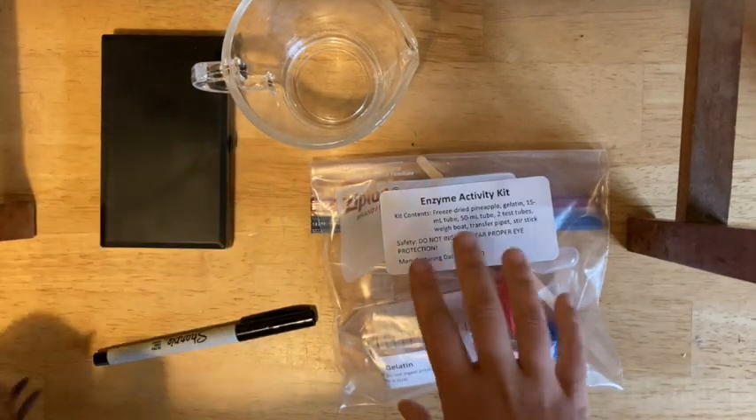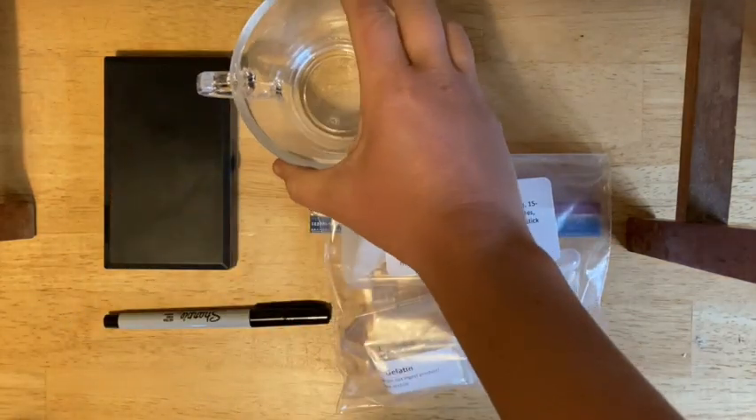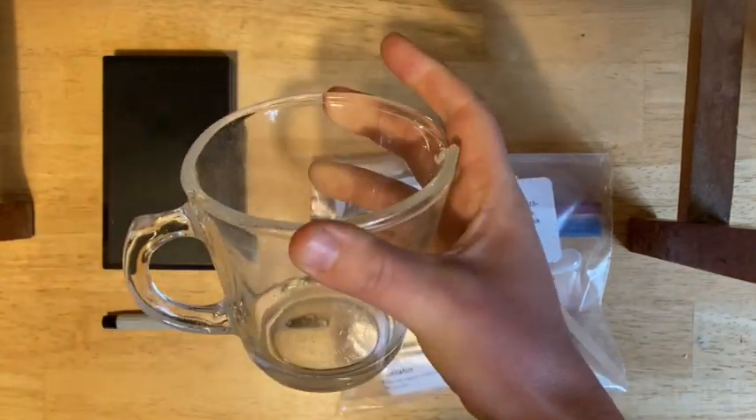The next step is to make some gelatin. This is going to be the substance you will use to test whether or not your bromelain is active. You've got your enzyme activity kit — you need your sharpie, your balance, and some sort of heatproof vessel. Something with a pour spout is ideal, something that can be microwaved.